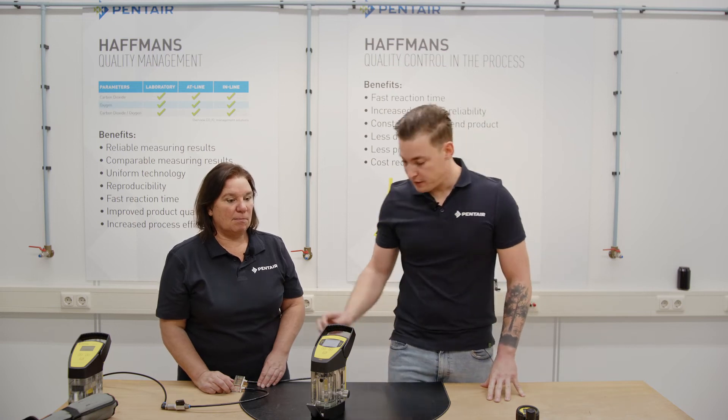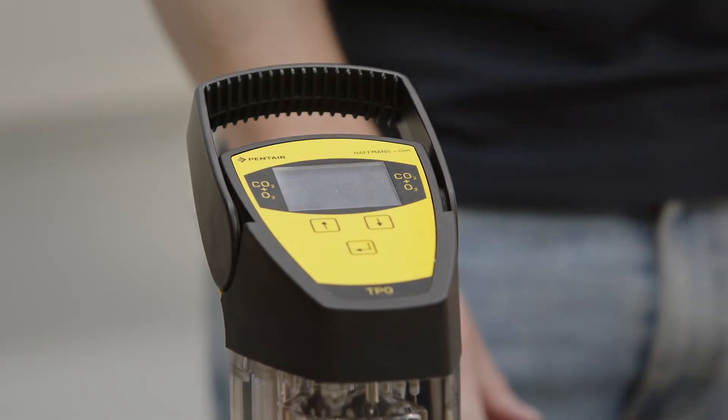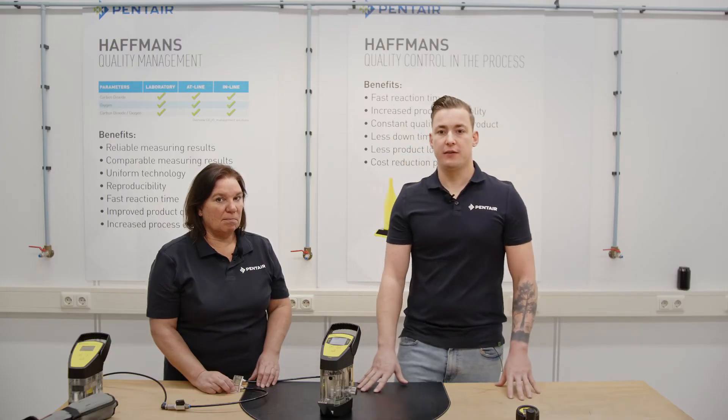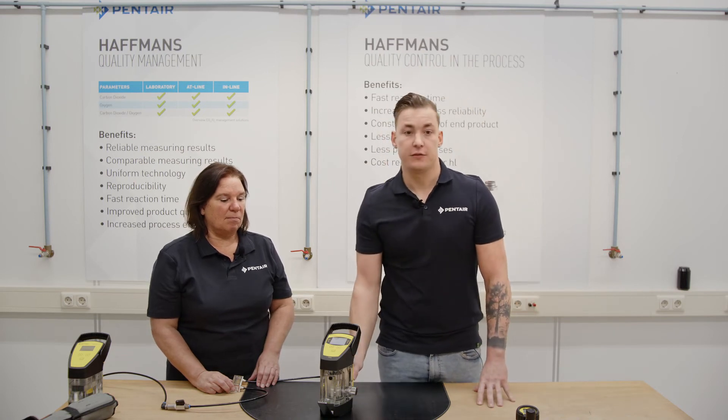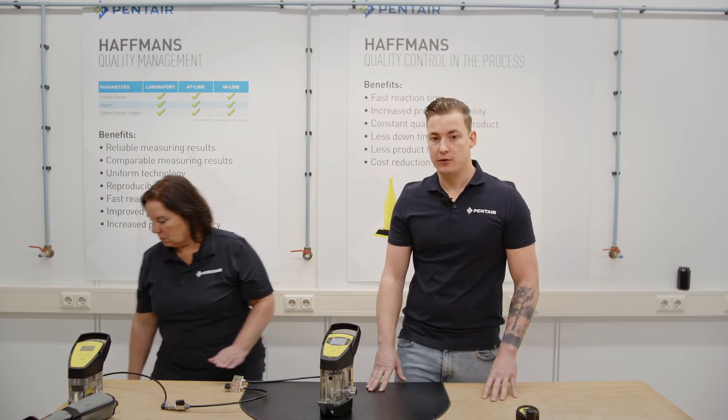After that you can start calibration. Adjust today's atmospheric pressure and calibrate the low point on 0.0 percent. After that connect the high point calibration gas. Again purge for approximately five minutes on low flow and check if the amplitude finally stays stable, then calibrate on one percent.